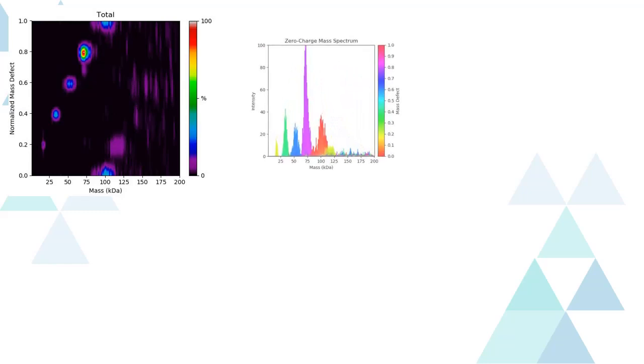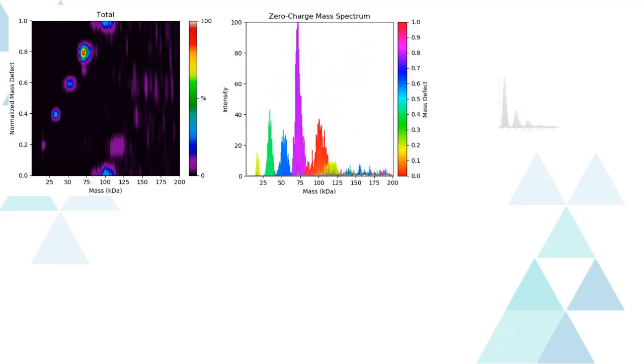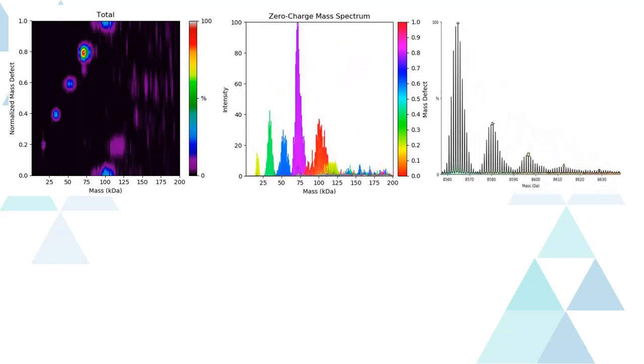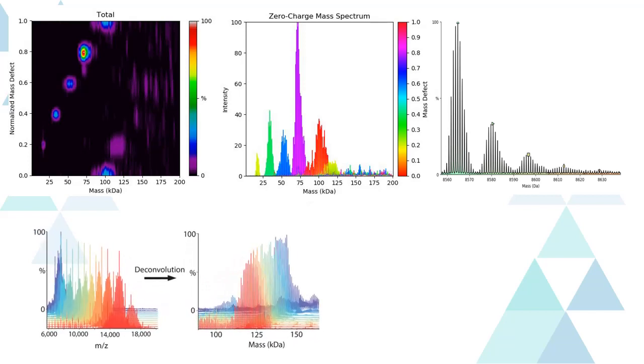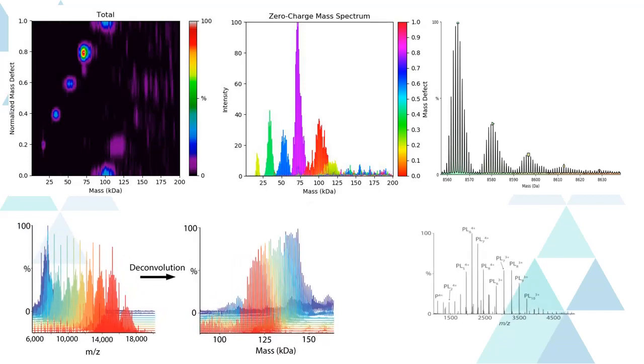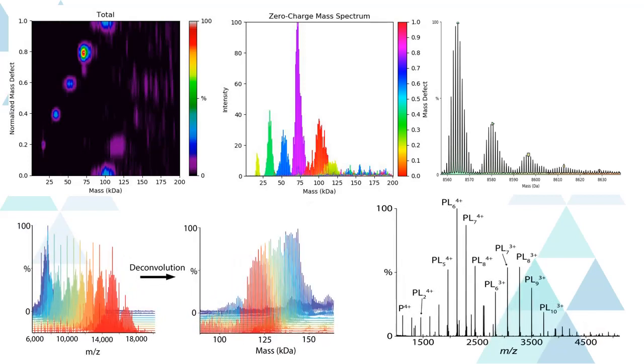Unidec stands for Universal Deconvolution and works well for native mass spectrometry, but can also be used for denatured proteins. In this series of tutorials, we will demonstrate the basics you will need to get great data from your mass spectra.